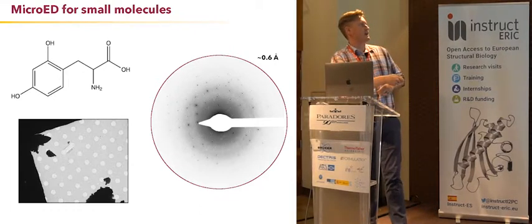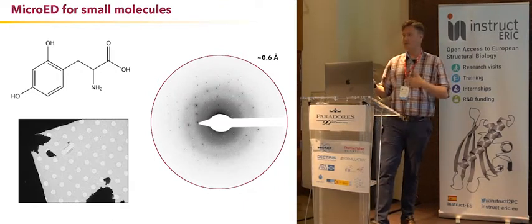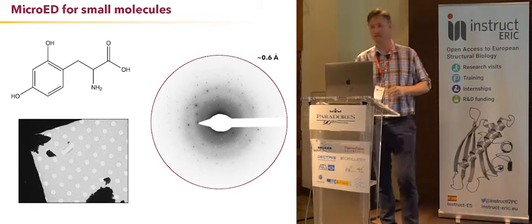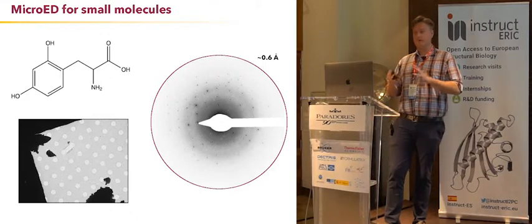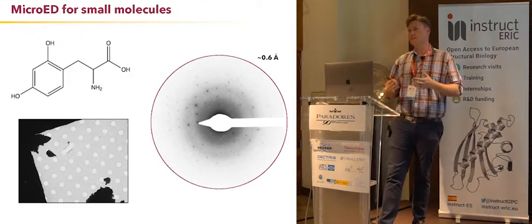It essentially looks like tyrosine, but with another sort of hydroxyl component. And they're trying to use this enzymatic process to make this unnatural amino acid for some other purpose. I'm not quite sure what it is. But they made something, they didn't know what it was. They took it to NMR, they got an answer, but it was kind of vague. They tried NMR again, didn't get an answer. Then they tried NMR a third time, they got an answer, but they couldn't interpret it.